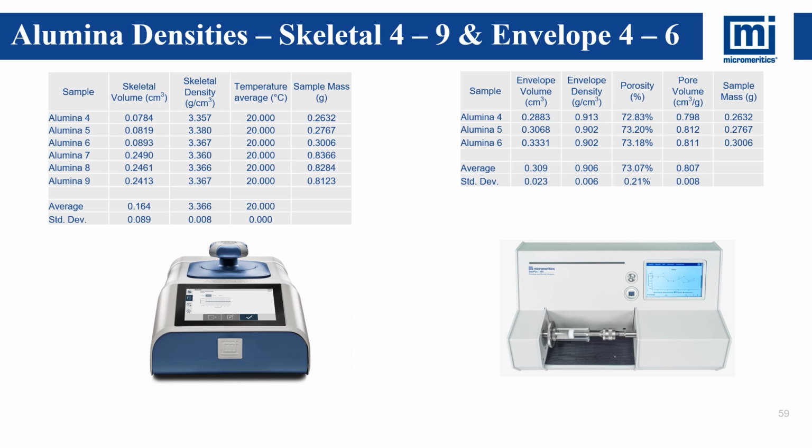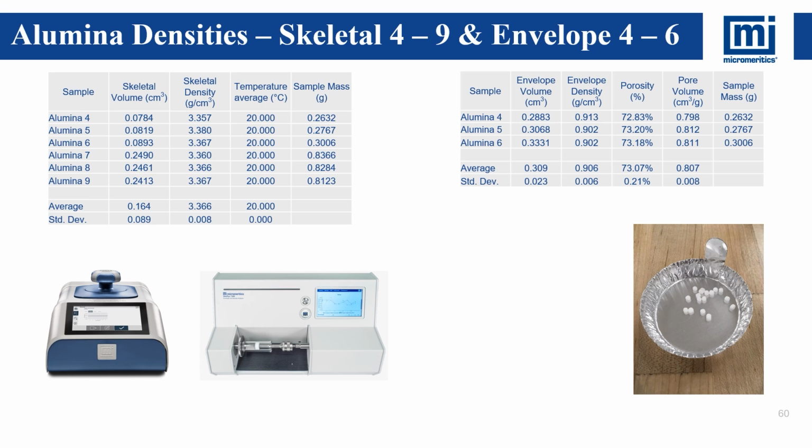Now for these samples, we had about 17 of the little pellets you see here under test. They're mostly spherical in shape. Now the way in which the dry flowing powder that we use to determine displacement packs around these is related to the size and the shape of the material.